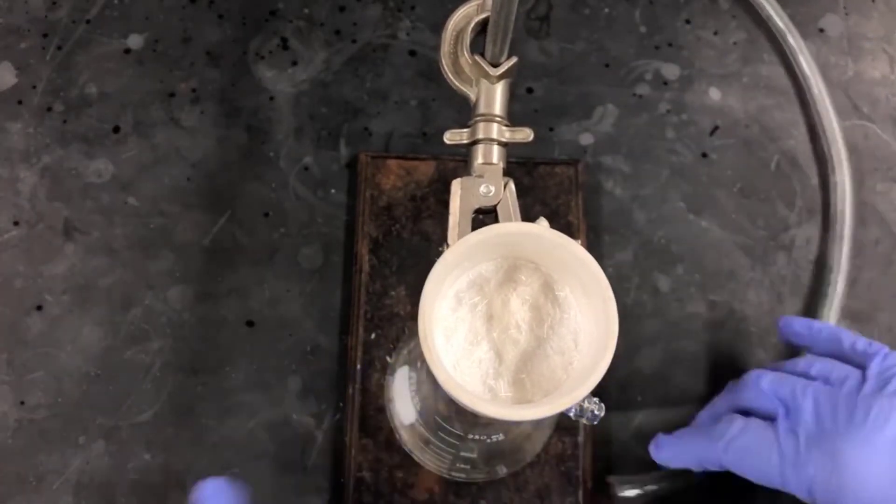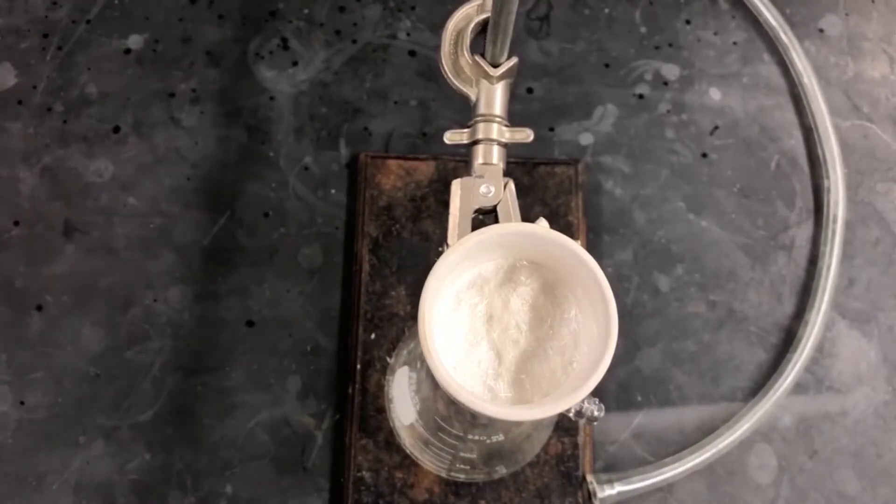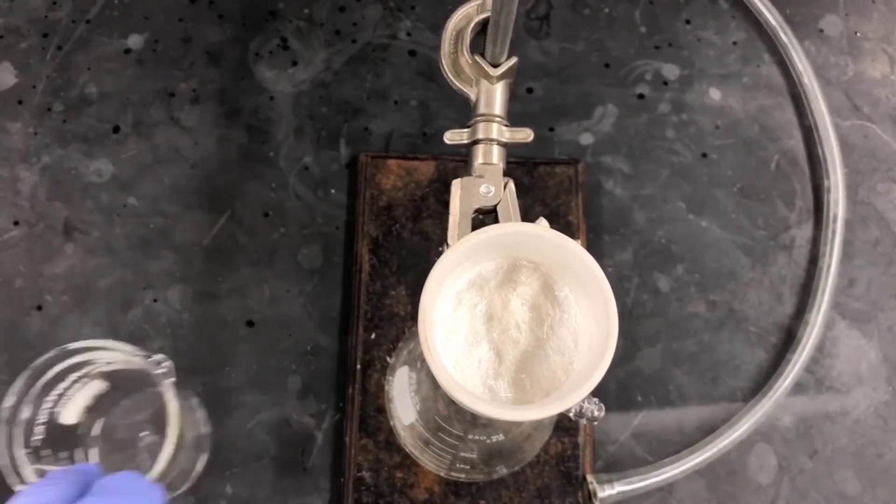Here again, I'm removing the hose to break the vacuum before I turn off the faucet. This prevents water from flowing into the filter flask.